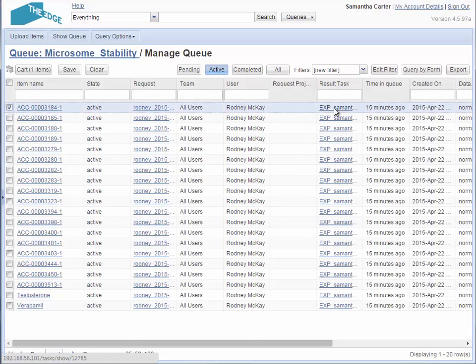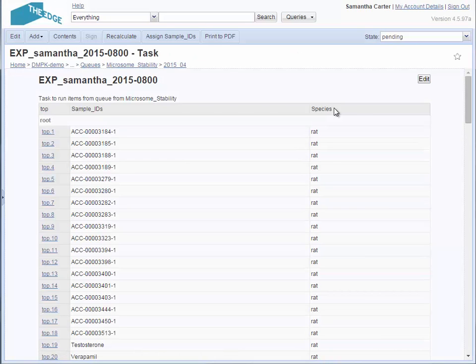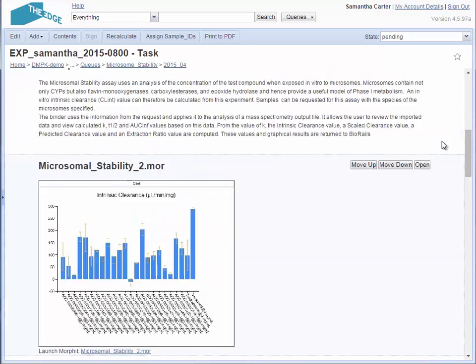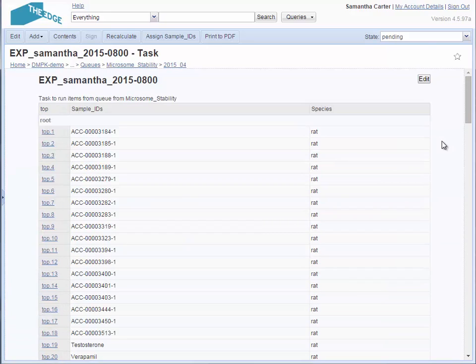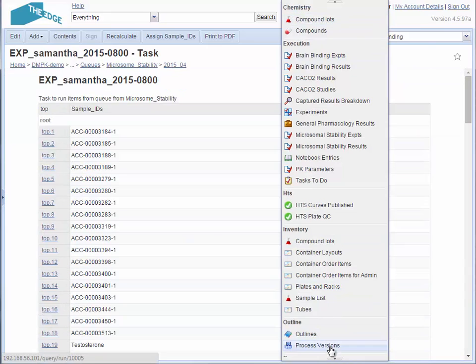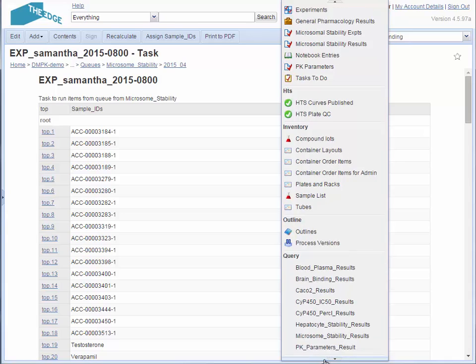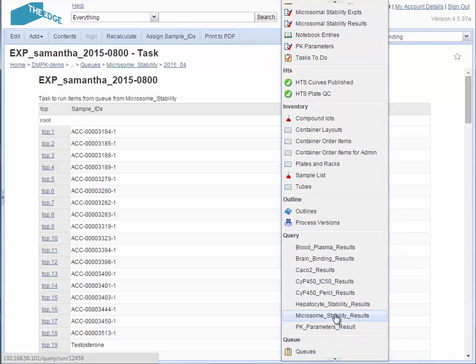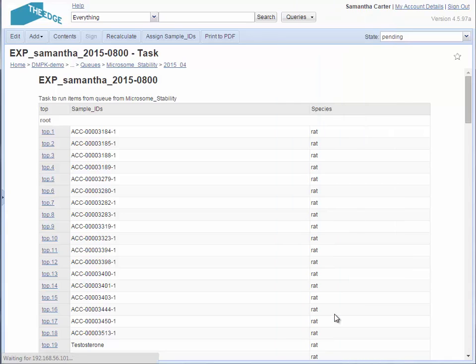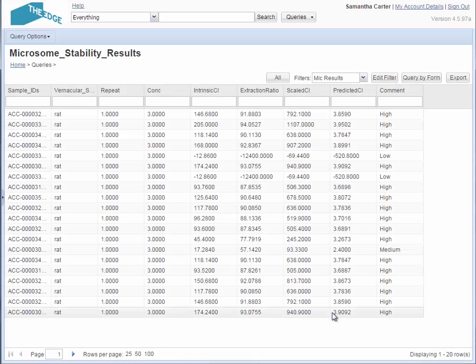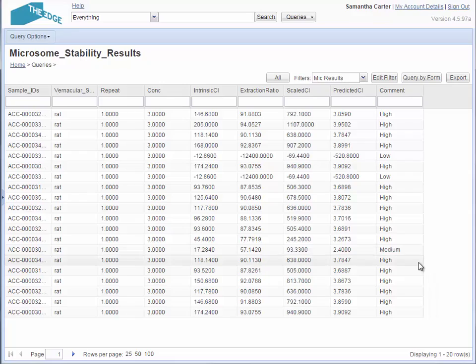There is a link to the result task. All of the data here can be exported in a variety of formats. You can also use a query to look at all of the historical results of the assay. Specific samples can be searched for, and samples can be ranked by their results.